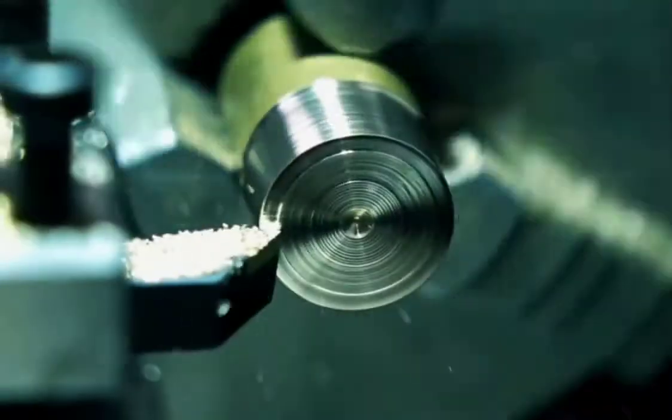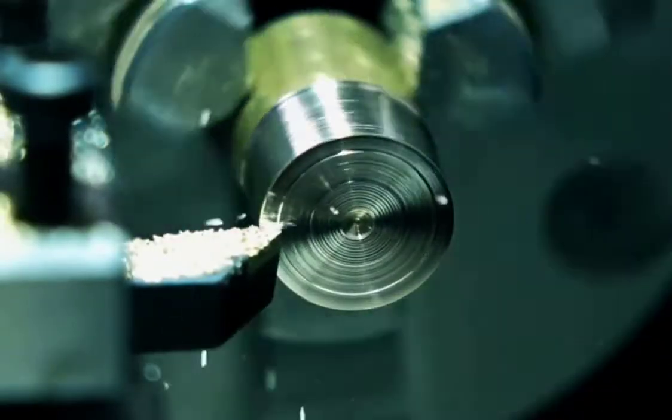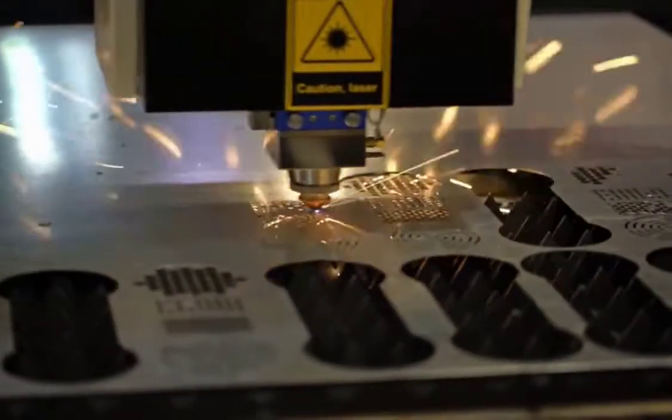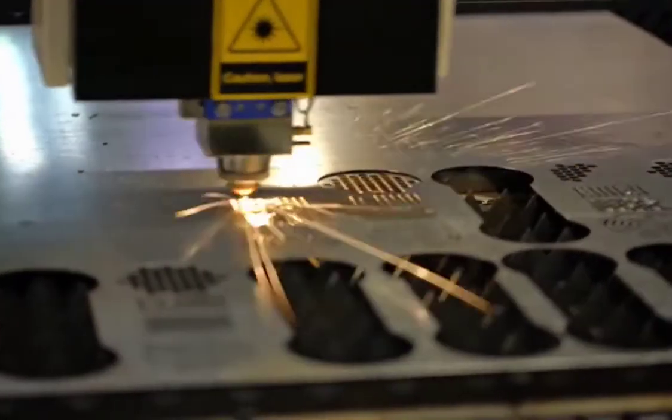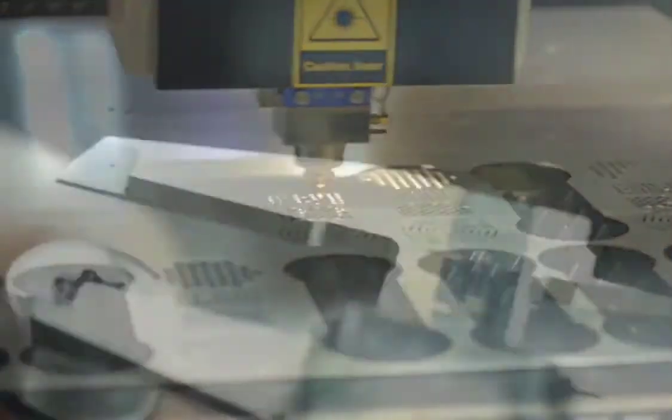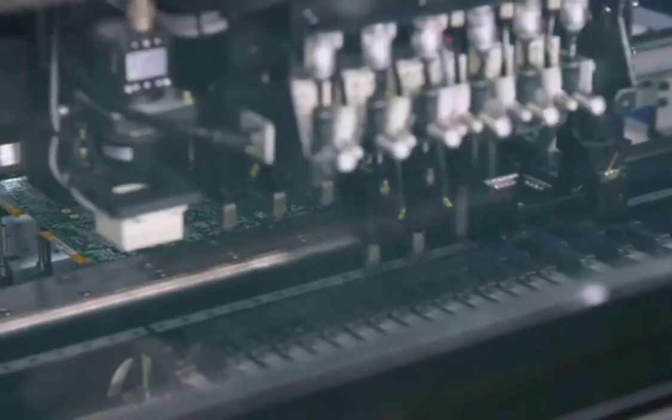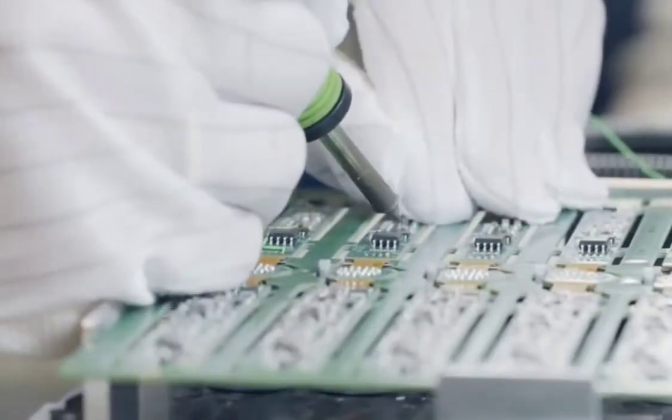All parts are manufactured with great care and Swiss precision. Every part is subject to strict testing. Electronic boards are produced in-house.